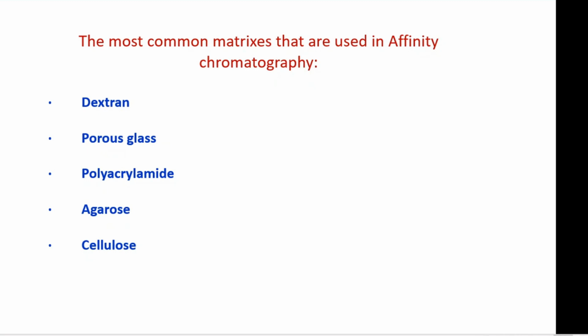Or stationary phase. Dextran is a polysaccharide and porous glass is a glass material, which can have the adhering capacity with the ligand molecules. A small glass wool, you know that, right? The glass wool is very specific, where we can see this glass wool can get packed in the column. When it gets packed in the column, it makes some pores, right? And this porous glass wool can help us to make the column, or it will act as a matrix.